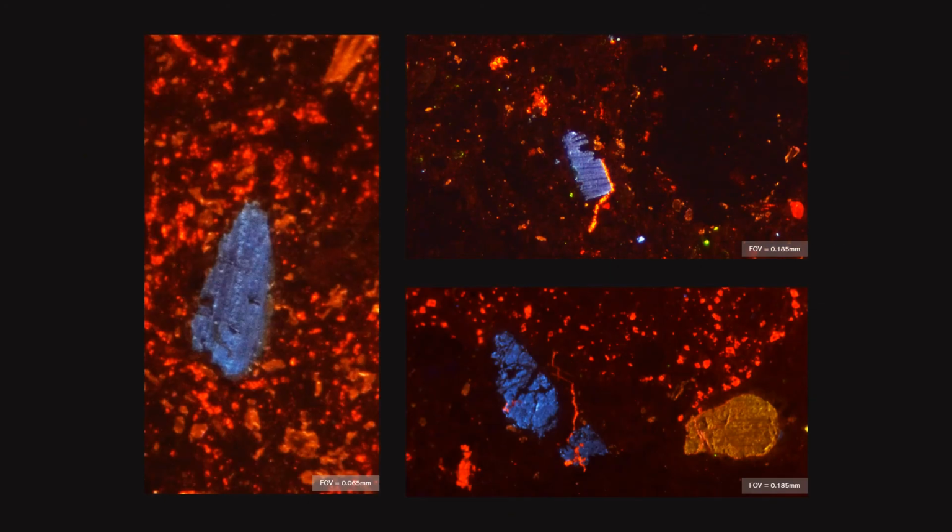CL was also really useful in identifying the fluorapatite that was in the sections. So those tiny gray grains weren't always easy to pick out of the large amounts of gray quartz and gray carbonate lithics that were making up all of the slides. But you'll see here that they luminesce a really bright blue against that red-orange background, so this made them much easier to identify.